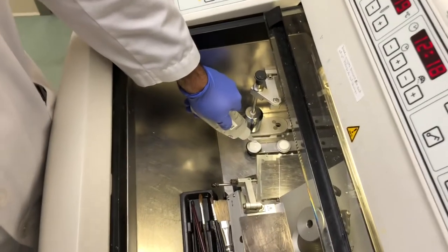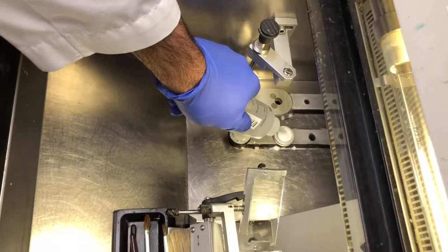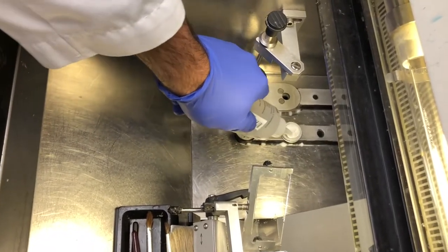Put a layer of the OCT compound onto the chuck. OCT stands for optimal cutting temperature compound. It consists of ethylene glycol and polyvinyl alcohol.